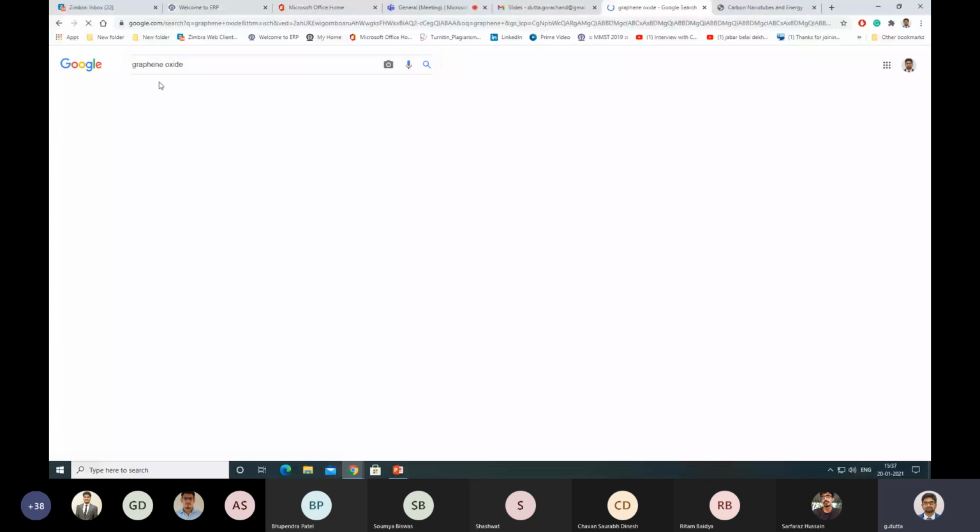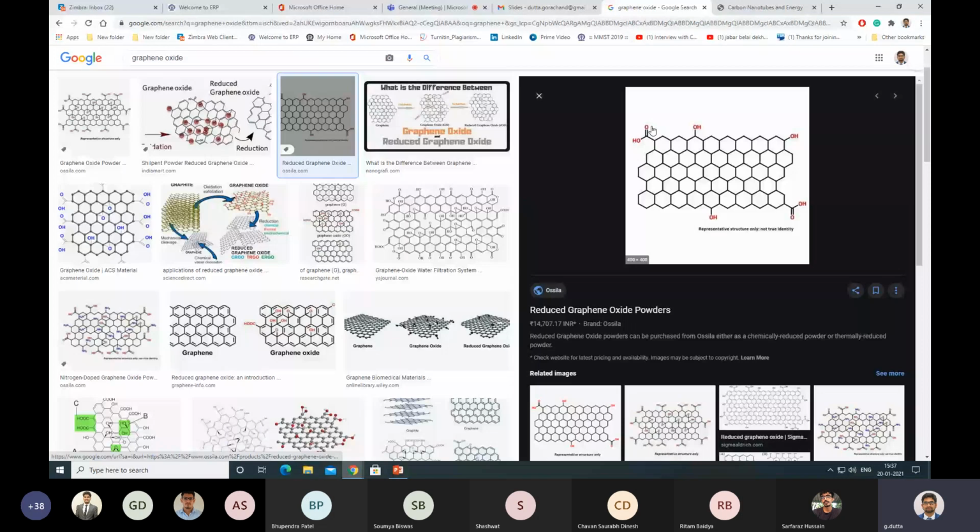The surface actually contains some C-O-H group, but you can oxidize the surface, and you will get many COOH groups on the graphene oxide. So this is a sheet-like nanostructure, and you can just drop cast on your electrode surface. Just drop, dry it at room temperature, and then wash the surface. Then on the surface, you can treat with EDC NHS.